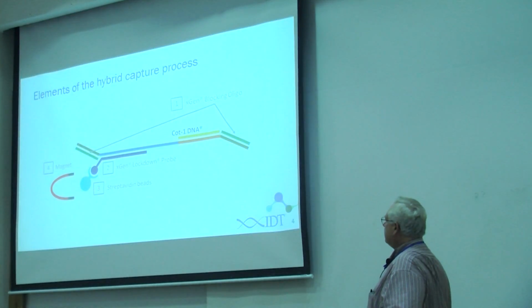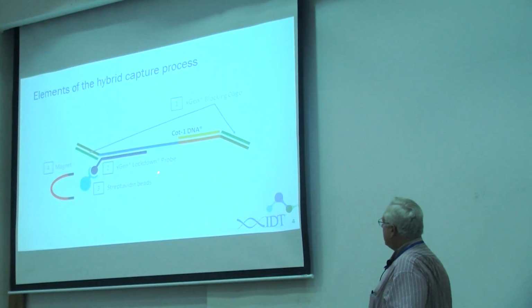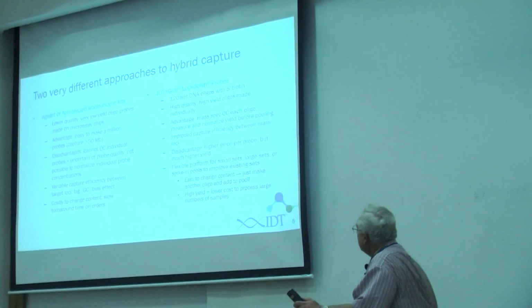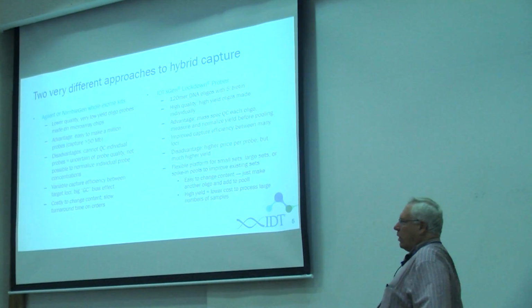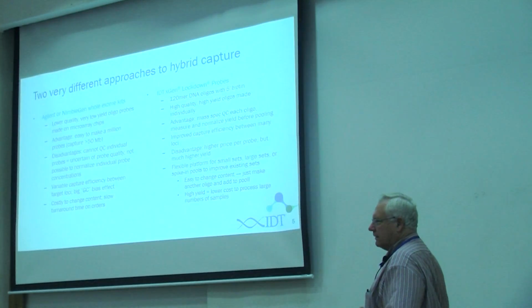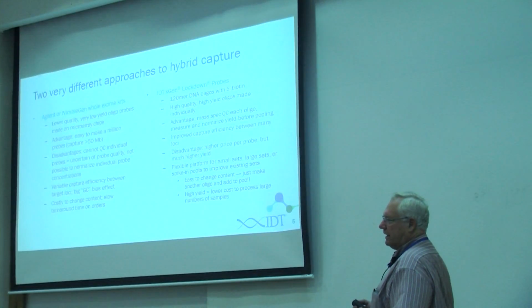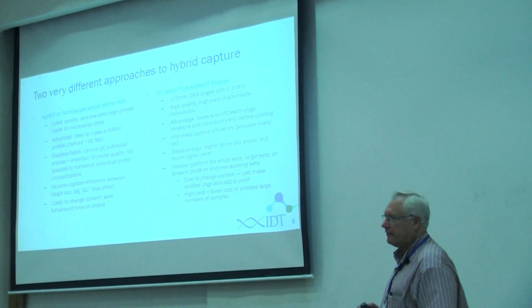The drawback is that it's a slightly more complicated workflow, and it's a little bit more expensive to get a hold of the probes for something like this. Now, right now there are sort of two general strategies to do capture. One is using oligos that are made on arrays that you can't QC. So you can make 100,000, a million oligos on an array, and then cleave them all off and make libraries out of them, make capture pools out of them, all kinds of things you can do.